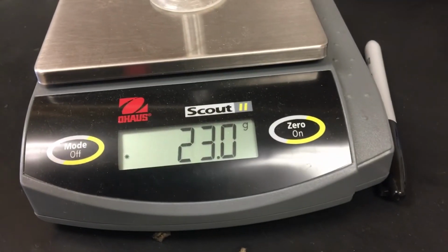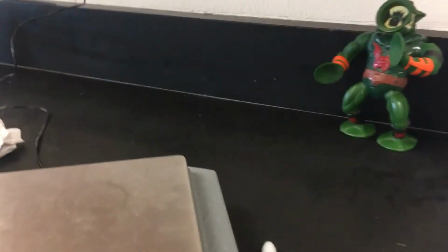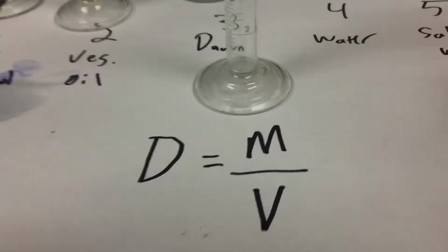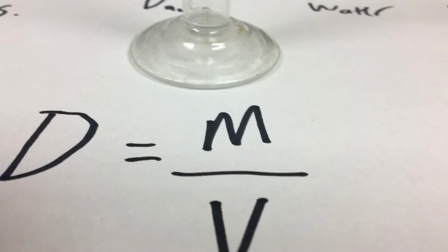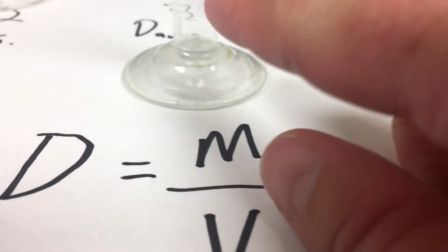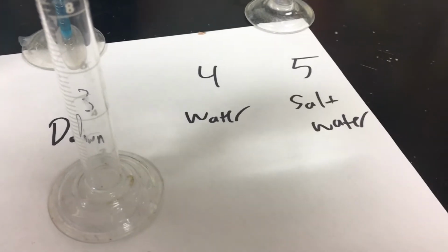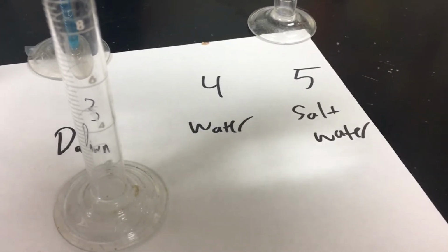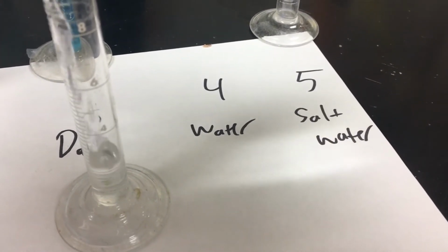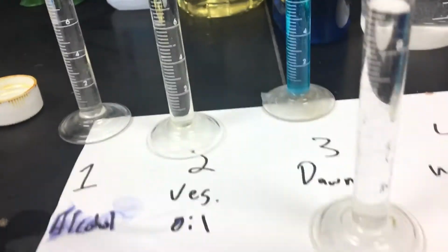There it is, empty. This one's gonna be just plain water. Now, water, the way they set up the metric system was once they invented what the meter was, they made everything based on that. So a centimeter, a cubic centimeter, that size, 1/100 of a meter, and then you make a box 100th of a meter by 100th of a meter by 100th of a meter is a 1 cubic centimeter box. Then they said that's also going to be what a milliliter is.